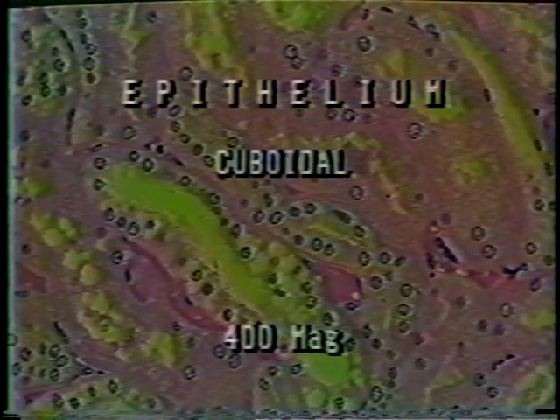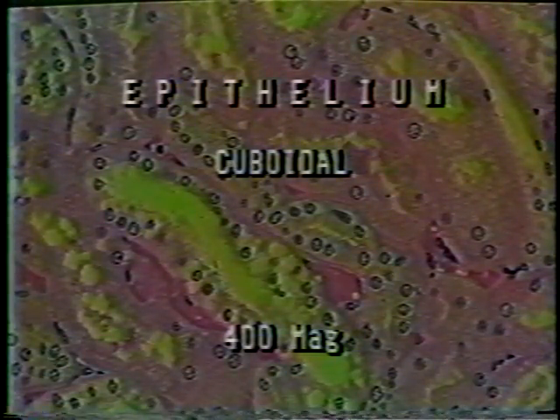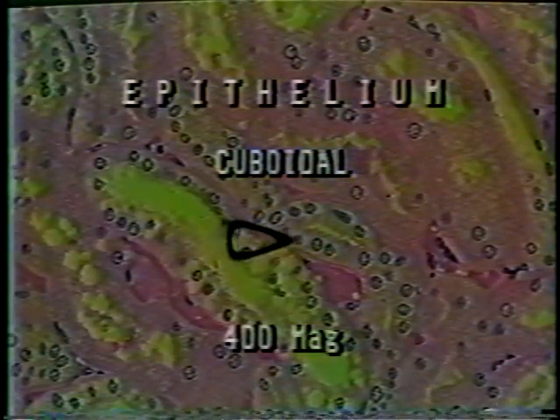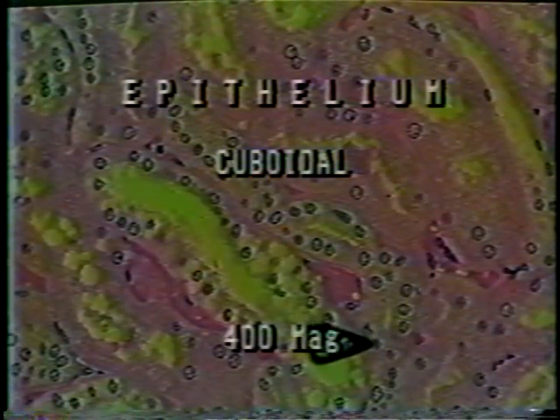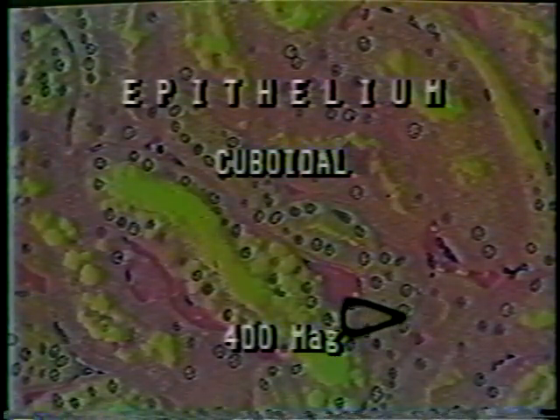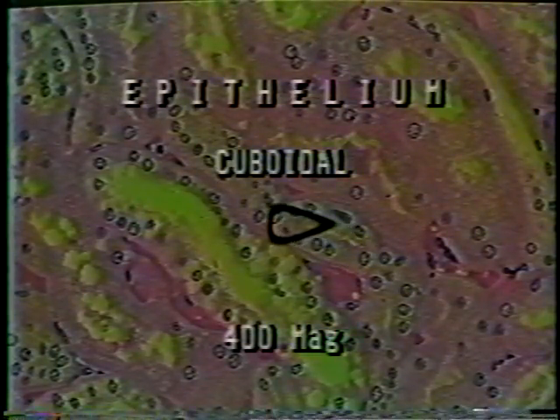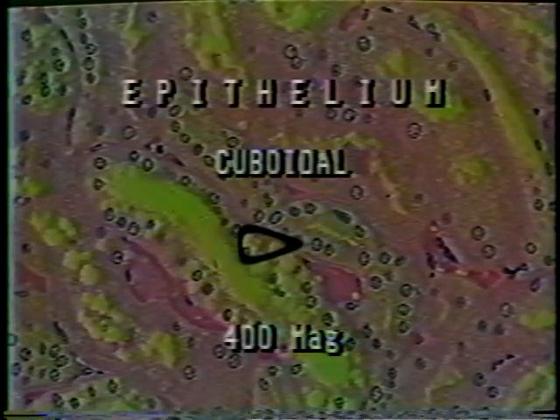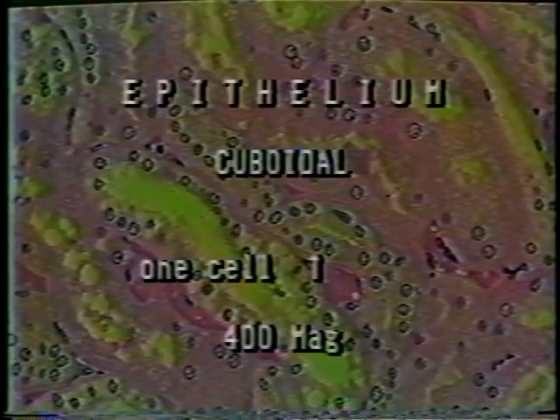These tubes and their cuboidal cell lining are seen better at 400 magnifications. The arrow is pointing out cuboidal cells. Observe that this cuboidal tissue does have a free border. The lumen, however, is very narrow. You can't see the cell membrane, but you can see the evenly spaced blue nucleus of each cell.